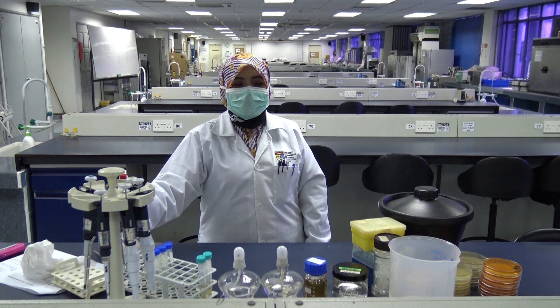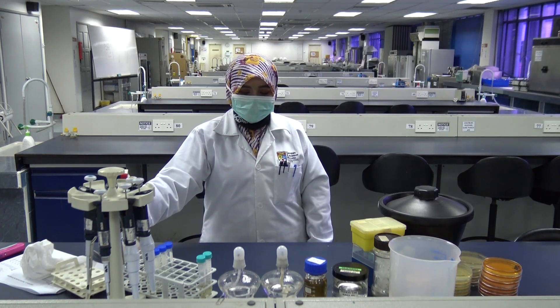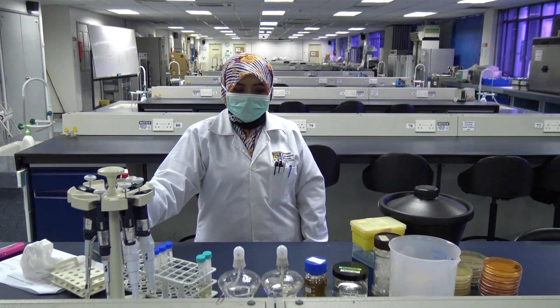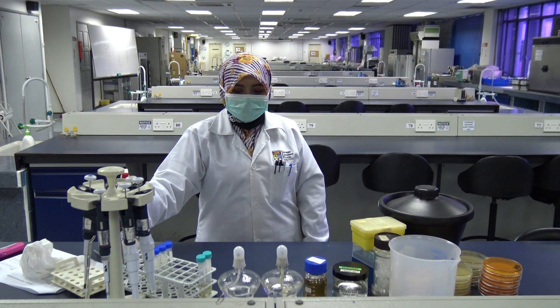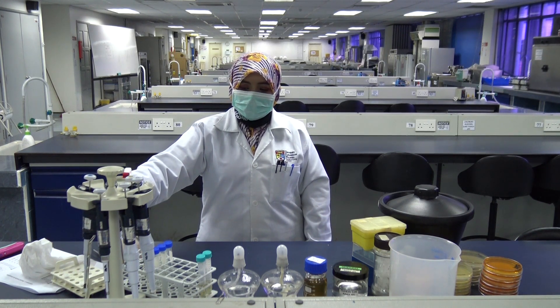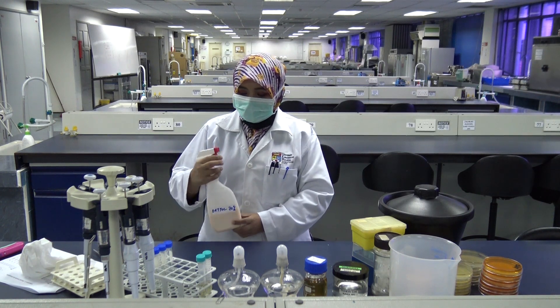Good afternoon everybody. Today we are going to do the second lab, which is on Plasmid Transfer by Conjugation. The first part will be Plasmid Transfer by Conjugation and the second part will be Phage Infection. So let's start off with the first experiment, which is Plasmid Transfer by Conjugation.